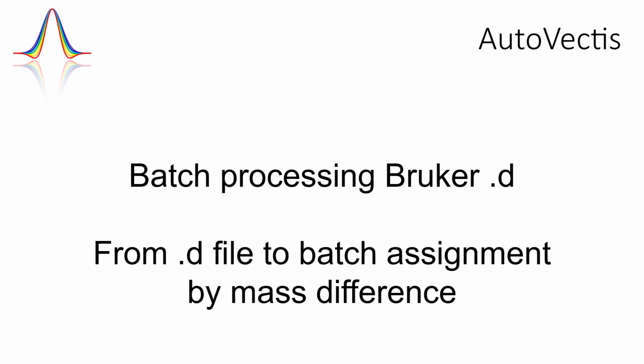Hi there, in this video I'm going to be giving a demonstration of batch processing Bruker MRMS or ICR files in AutoVectis. So we'll be starting with the transients and going all the way through batch phasing, batch assignment, in this case of dissolved organic matter, right the way through to producing a single database file combining all the outputs in one.